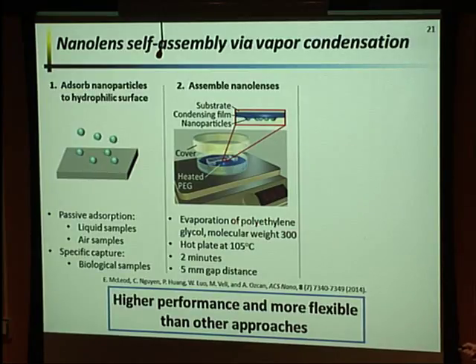We're using polyethylene glycol for a couple of reasons. It's non-toxic, so you don't have to worry about doing this in a fume hood, which is one major reason. The other reason is that since we're using a polymer, we can control the molecular weight, and this means we can control the rate of evaporation at different temperatures. So we do this for a couple of minutes, so we don't have to wait too long.